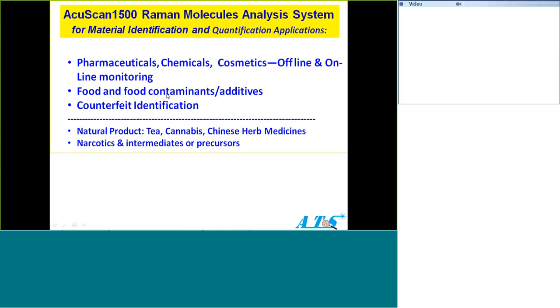Okay, two questions there. To validate it, there are two functions. One is identification, based on the library spectrum. You compare with the library, and it tells you right away it's acetaminophen. Our software also gives you the identification and the data to report, say all 100 tablets are acetaminophen. Number two is the amount, like validating content uniformity, that's quantification.